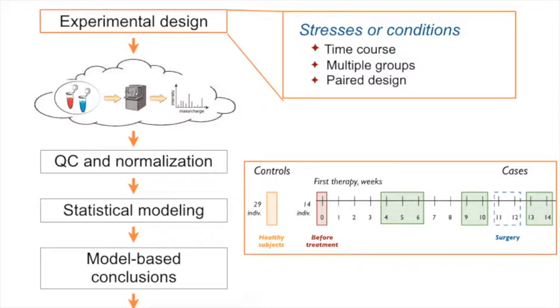And you can ask questions such as, does the protein abundance here differ from the protein abundance in the controls? After the treatment, did the protein abundance get reduced to the level of controls, or did it stay the same at the level of the disease? And things like that. So this is an example of a design where you really want to analyze all the conditions jointly, but you need to know how to represent these conditions. And most importantly, how to characterize the variation associated with that, to say that this change is more systematic than just random chance.